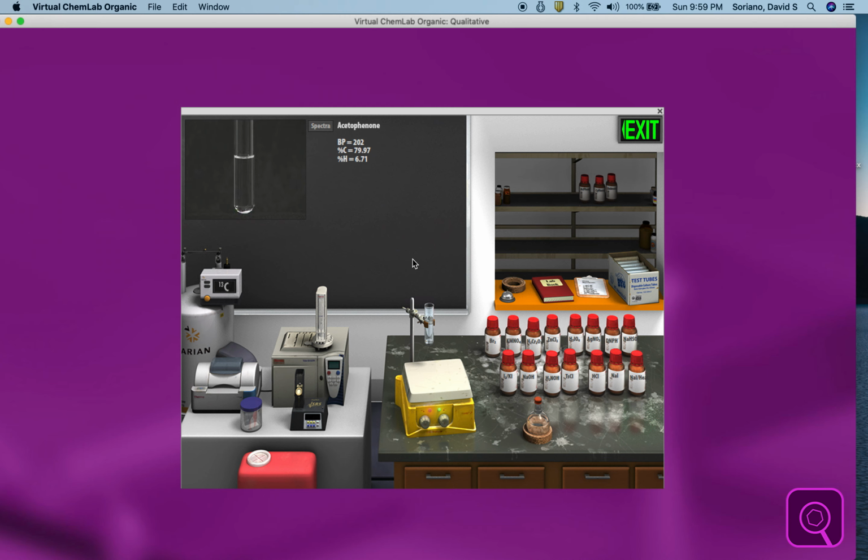And what we'll do, we'll treat the acetophenone with bromine. So I'll transfer with a pipette. You watch the blackboard. Put that in there. And it's starting to stir. It's being heated up a little bit. You'll see the transition of color as we make alpha-bromoacetophenone. And I anticipate that we'll go colorless once the bromination's done.